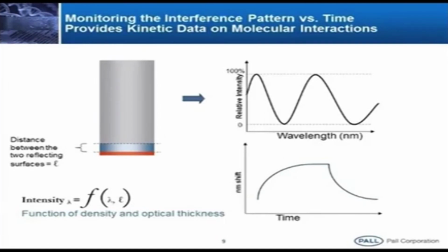What is the on rate? On rate is nothing but the association rate. Off rate is nothing but the dissociation rate. So, dissociation rate divided by association rate gives the affinity. So, we have to determine these affinity constants. If proteins are interacting strongly, we call this affinity picomolar affinity. If there is a moderate interaction, suppose when an antigen binds to an antibody or a protein binds to a receptor, you will see the association phase.